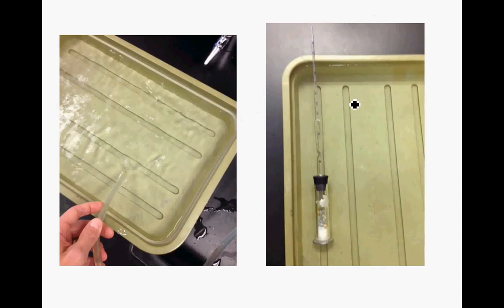Next step is these water baths will already have been filled, probably with water, and this water will be at room temperature. You're going to take your assembled respirometers and lay them down in the water so that the tip is out, resting on the edge right here, and this is where it comes out of the water. So this is all submerged, and then this is out, not submerged.